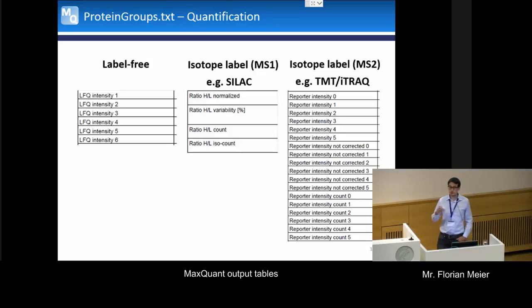If you somehow find out that you put the wrong distribution in the correction parameters, you could actually do the correction here on your own, just by taking the non-corrected values. And again, also always very helpful: how many peptides went into this ratio. Ideally, we have a lot of peptides, and then all of them make up a very precise and accurate ratio for the proteins.